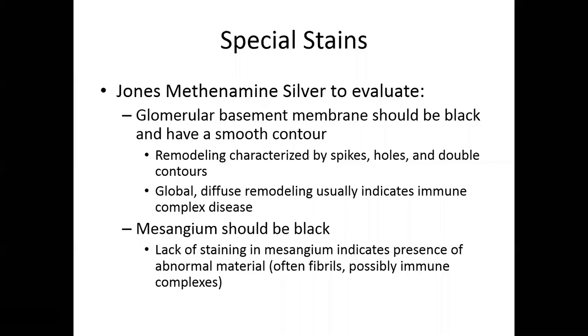If you really need a Jones stain because you really want to look at a case, send it to us. It'd just be easier for us to do it for you than for you guys to try to perfect the stain in your own lab because you might use it once a year. So give us a 3-micron copy of the slide and we would be able to stain it for you. That being said, if I get 100 glass slides in my box tomorrow, I'm going to be kind of depressed.